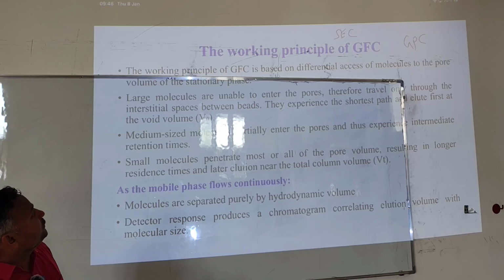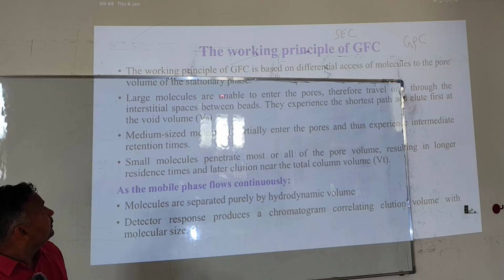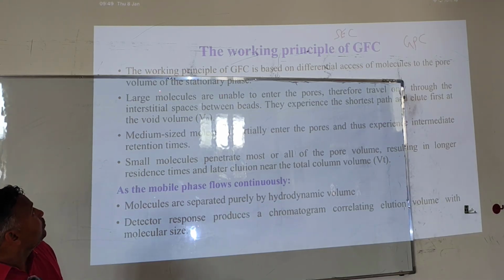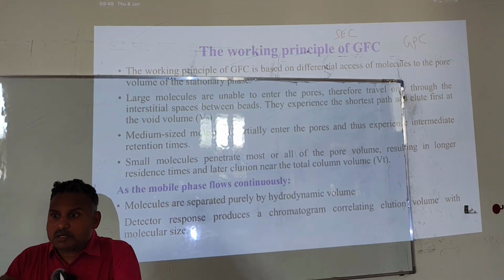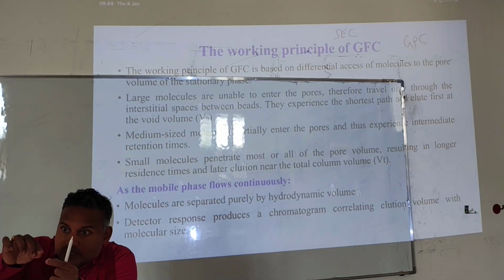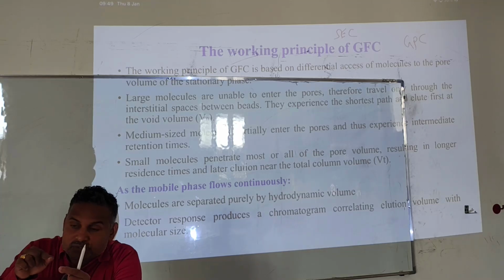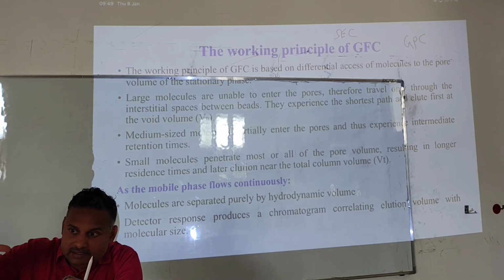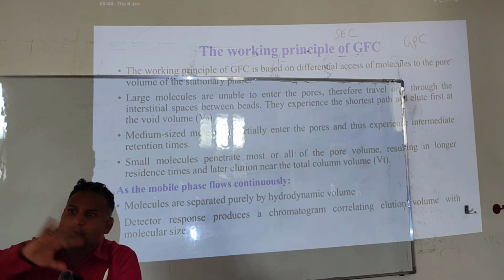The working principle of GFC is based on differential access of molecules to the pore volume of the stationary phase. Did you get it? Differential access. That means smaller molecules have more access to the pores. Medium molecules have less access to the pores. Bigger molecules, no access at all. That means bigger molecules are moving without entering the pores.